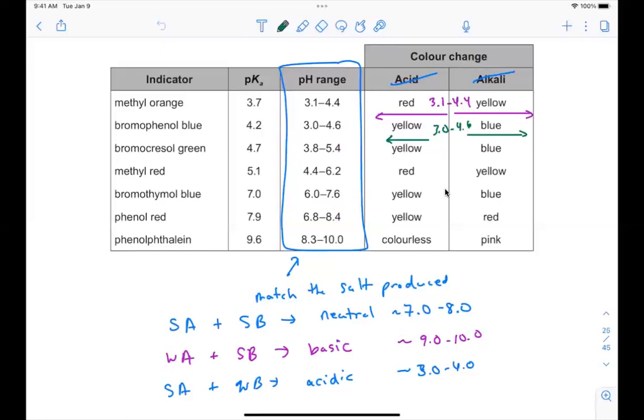Exactly. It's easier to see the color change, yeah. Because like yellow, red, what orange are we talking about? Yeah, yellow, blue, what green are we talking about? But pale pink, really, really obvious. So the practical reason why we mostly do that in high school is it's easy to see pale pink. It's easy to stop there when I can't tell you, okay, this orange is what you're trying to go for, or this blue or green is what you're trying to go for. But pale pink is very easy to describe. Yes, Christoph.